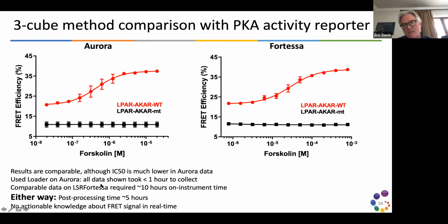With the Aurora, we could get similar dose response curves using the reporter engineered to report not on AKT, but on protein kinase A over a spectrum of doses of a very strong agonist.